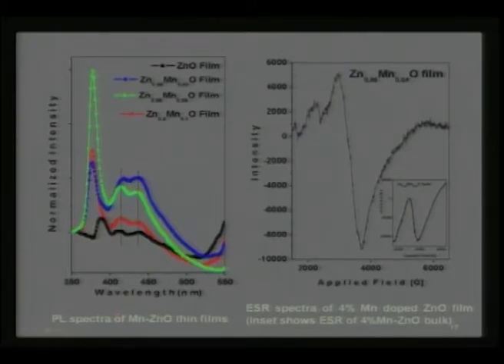As you would see here, compared to the solid state grown films, you still see a very nice 380 nanometer peak for the manganese doped ones, and here again the same story as that of solid state, where you see the zinc oxide shows a very low 380 nanometer peak, mainly because it is losing much on the defect induced concentration, whereas manganese doped ones are suppressing the 550 nanometer peak, but it is showing the 380 nanometer peak.